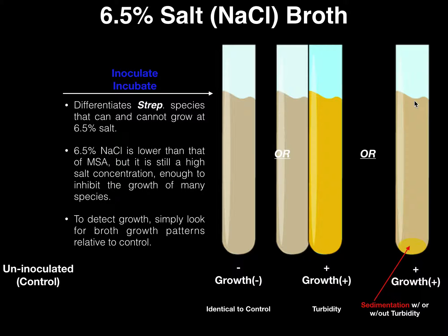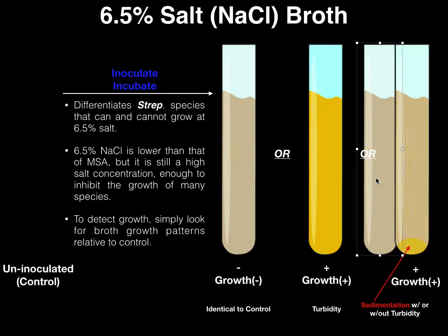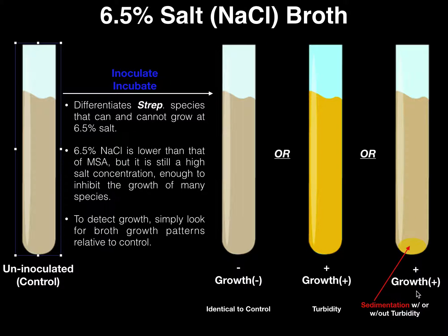In some cases, you might have turbidity and sedimentation together, which is automatically growth positive. In other cases, it may not look as turbid — it may look more or less similar to the control — but there may be sedimentation at the bottom. Even if the broth itself is identical in color and not very turbid, the fact that there is sedimentation at the bottom also means it's growth positive. Those bacteria survived the high salt concentration, so it's a growth positive result.